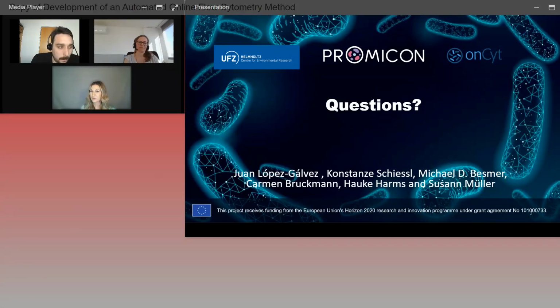Now we have time for a few more questions. Juan, I'm going to stay with you for this next one. Can you use the OC300 unit only with the flow cytometer used for these experiments, or can you couple it to any flow cytometer? I think Konstanze is better suited to answer this question. Yes, because it's basically about the OC300, which our startup produces.